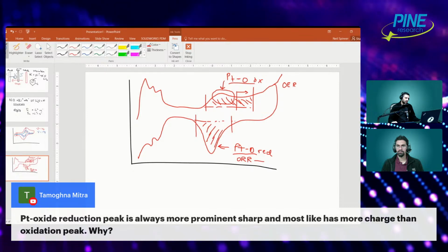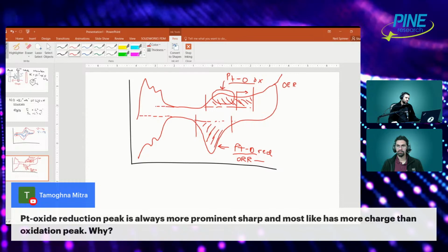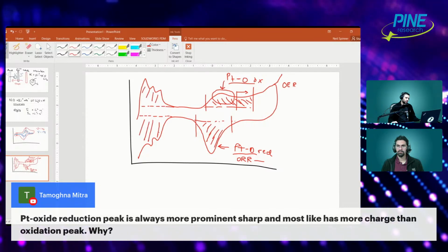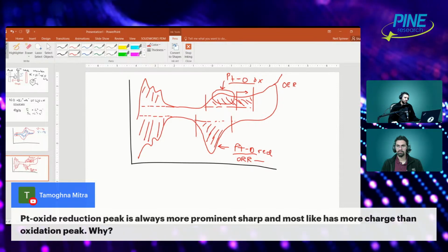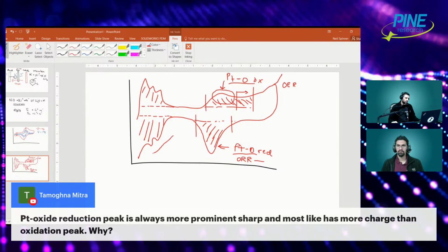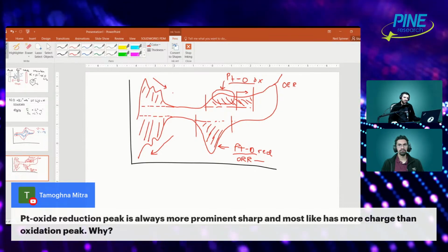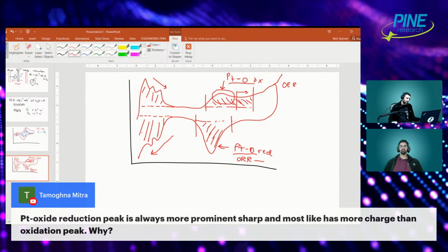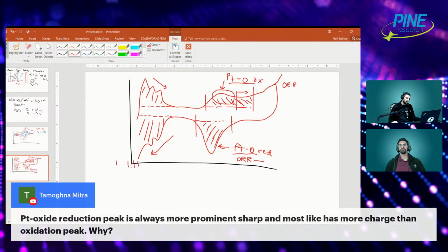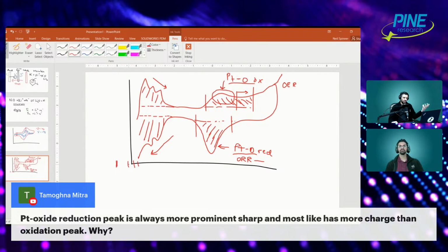The same thing happens when you're getting the ECSA, because you're basically taking the platinum hydrogen adsorption and desorption regions and getting this area. If you've done this enough times, these should technically be the same, because roughly the amount of hydrogen that you adsorb here should be the same that you desorb here, but it's not exactly the same. Why is that? Some of it's experimental error. Some of it's exactly how negative a potential you pick. Is it here? Is it here? That'll determine how much hydrogen is on the surface.